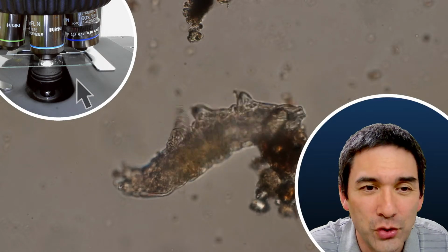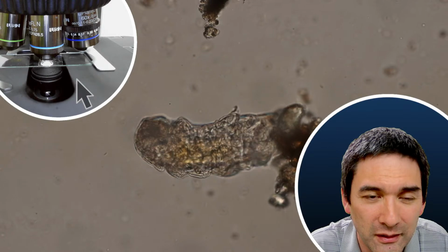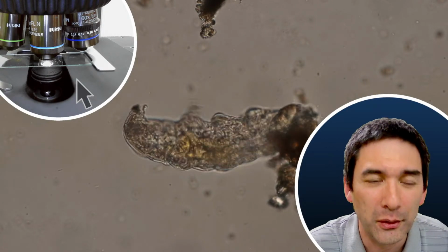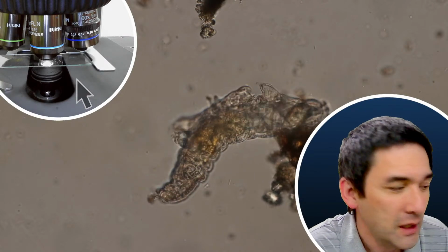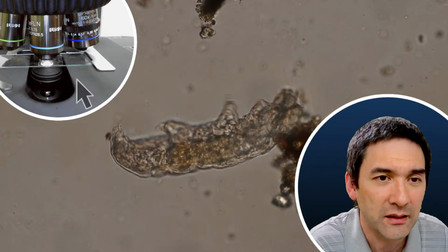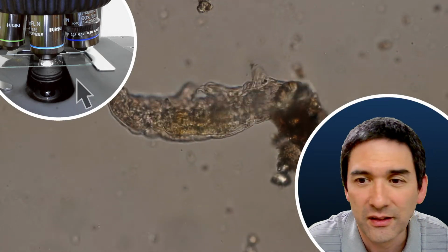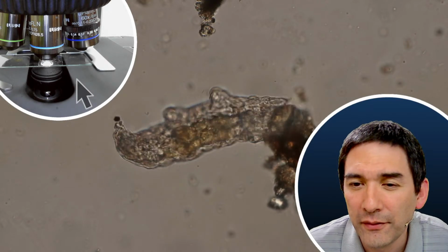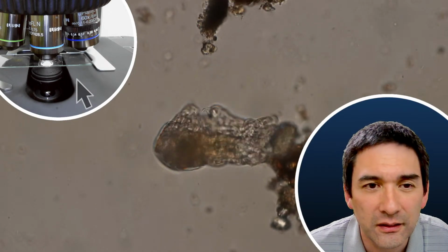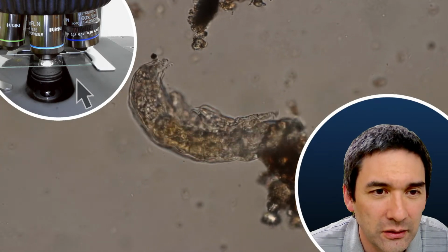Yeah, and if the microscope works reasonably well, then don't take it apart. I mean, taking the objective out and so on is not a problem. But I'm talking here about the actual mechanics, the coarse and fine focus knob, the mechanical stage, all of these things. Semiconductor companies do have their clean room. Exactly. I think for microscopes it's not that critical.